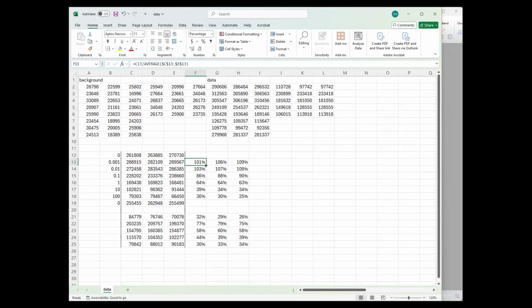If you have like 80% total binding in your zeros, you've got a really bad edge effect. Maybe your plate didn't filter well enough, maybe you didn't wash it well enough on the edges, or maybe it's just a factor of the plate. But you can do this and use the middle wells, which are going to be more consistent for your calculations. And so it's not that big of a difference, but you can see here that works.